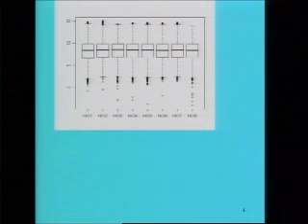What we notice here is, remember, it's single channel microarray data. So only one type of mRNA sample is hybridized on one array, and there is no question of dye bias. Whenever we are dealing with single channel microarray data, we need not worry about dye bias. It is not present at all. What we have to worry about is the variation due to artifacts which enter at various stages of the microarray experiment.